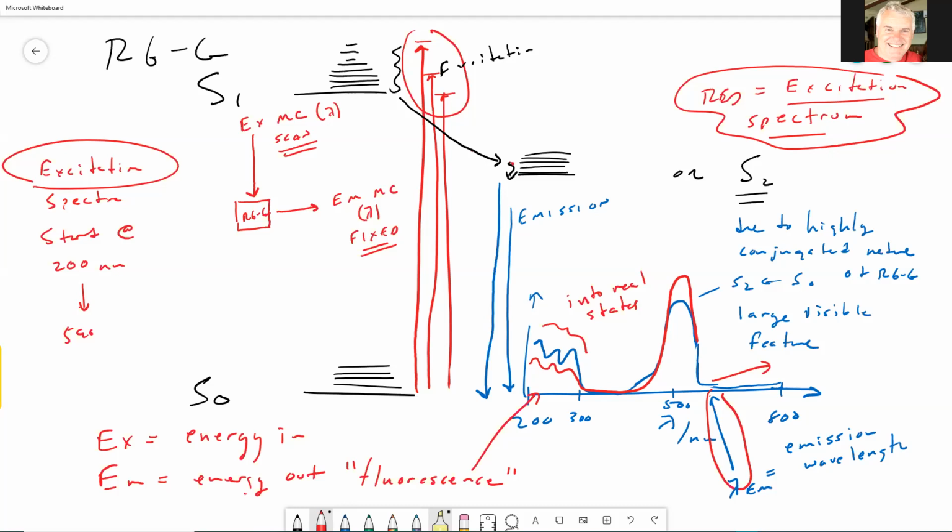You can see it changing states very, very slowly and going through various conformational state changes.